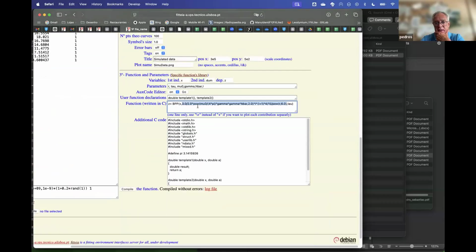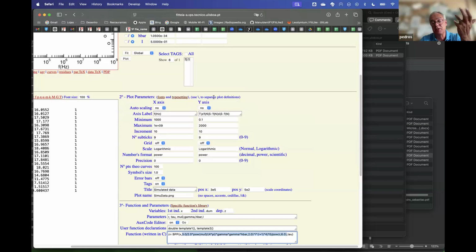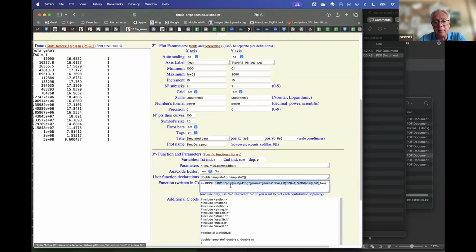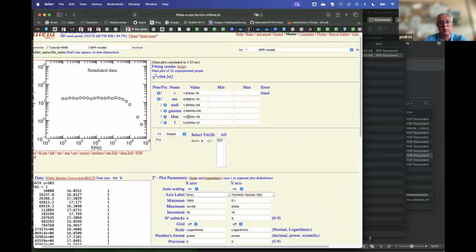And we can detail and check what this is, but this is the dipolar coupling constant as defined, and this is the definition of the spectral density in some way. Actually, it's the prefactor of your BPP, which is defined there. And the parameters are stated here, are declared here, and when you compile, you get the table with them.